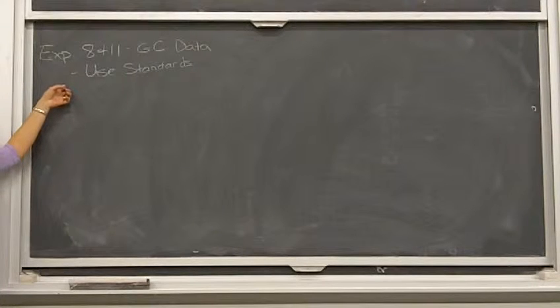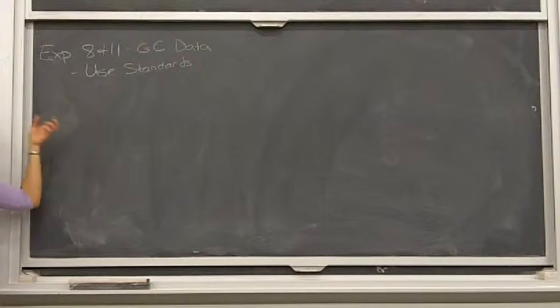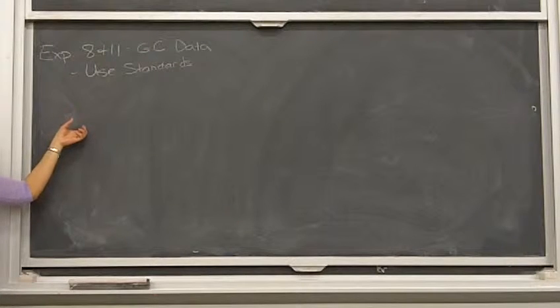We've got some standards, not all the standards, but you also have to think about your own reaction: what makes sense for your reaction, what should be there, what shouldn't be there. Be careful labeling anything an impurity. If you cannot figure out what a certain peak corresponds to in the end, using the standards, you should label it as an impurity, but be careful doing that. Make sure it's not something that is actually one of your products that you need to figure out from the standards and what you should have done in your experiment, okay?